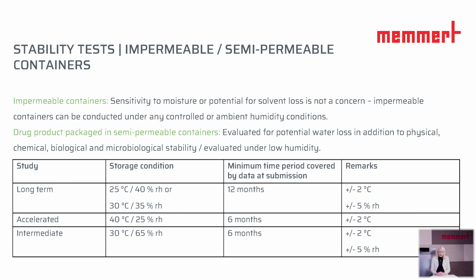These should, in addition to physical, chemical, biological and microbiological stability, be evaluated for the potential water loss, and this can be done under lower humidity. Here the customer can decide whether to do it at 25 degrees 40% RH or 30 degrees 35% RH.